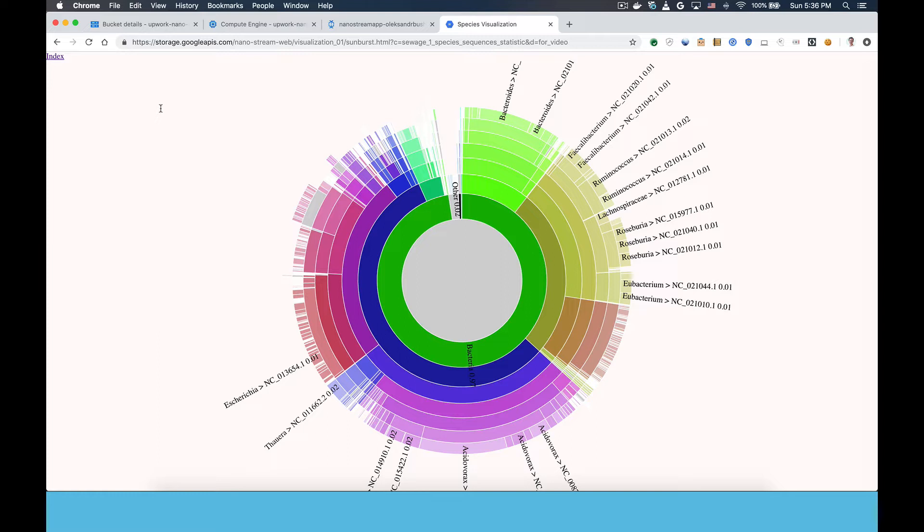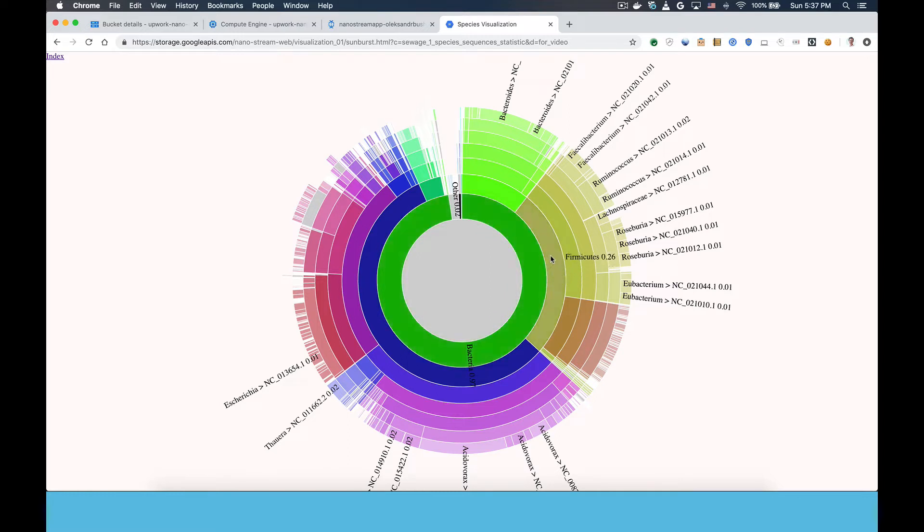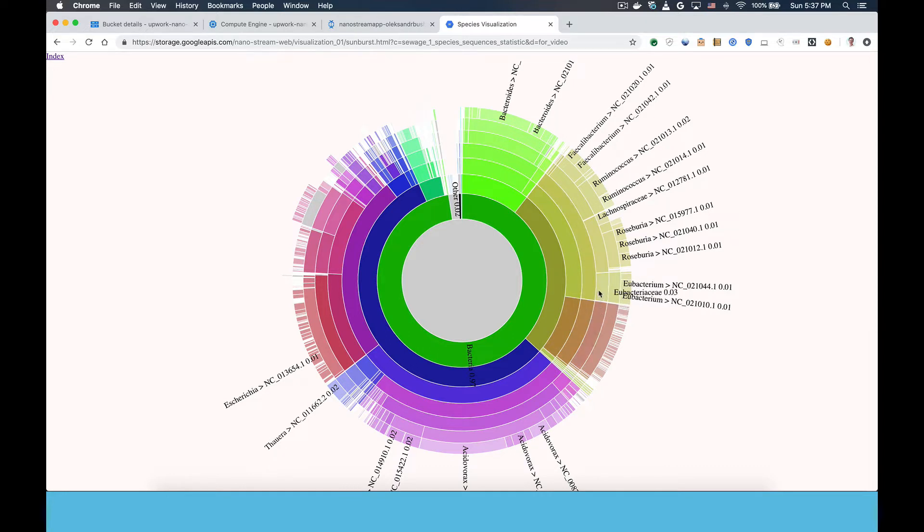What I'm showing on the screen right now is a visualization of a processed sample so you can get an idea of how the end user interface works. You can see there are some concentric rings and that each ring is broken into arcs. Going out from the center, the innermost rings represent high-level classes of living things like bacteria, plants, animals, viruses, fungi, etc.